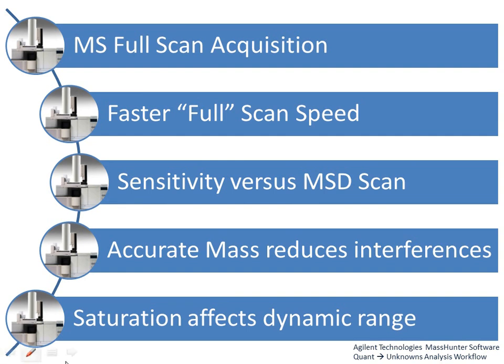Now on the other side of the coin, let's discuss saturation very briefly. From a dynamic range point of view in quantitation, saturation is going to affect you on the high end. At a certain point, that detector will not be able to go beyond that because the ion that you're monitoring turns out to be saturation effects. And the same goes for deconvolution. Some ions could be affected, which could lead to a deleterious effect on your score.